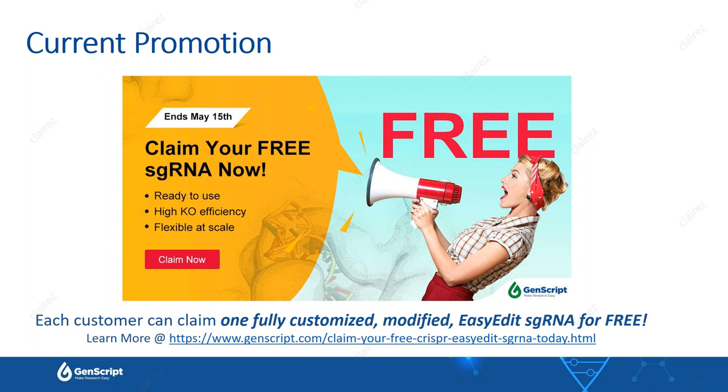Another question, any comments on the stability of RNP complexes maintained in solution? So actually, because the sgRNA essentially is an RNA, even though there are terminal modifications to ensure stability, we still recommend you to make them fresh and do the duplex or form the RNP before use. So we do not recommend to store a substantial amount of the reagents in your freezer in any kind of solution for a long time, just to maintain the activity of the complex.